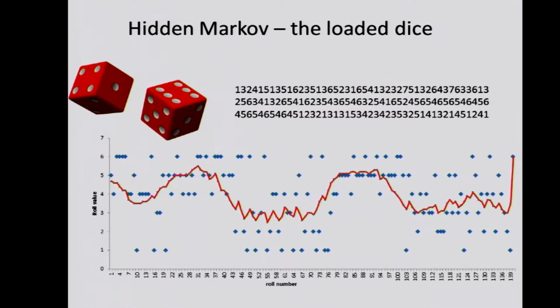And we can average them together and create a path through the data using a sliding window where we average every 5 values together and plot. This is a smoothing function. So this brings outliers in to get an idea of what the local average value is during the course of the run, or in this case, the course of the die rolling experiment.